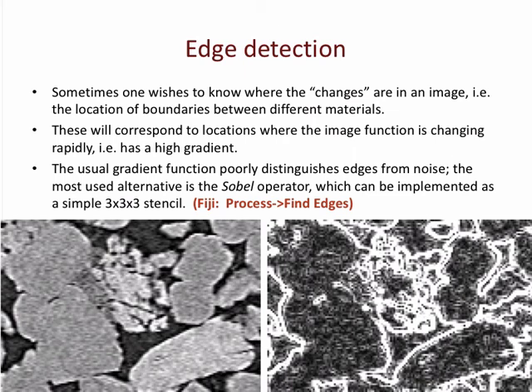So that filtered image is actually an image of means or medians. But I might want to look at the variance basically to see what the differences were in different neighborhoods. And again, I'm going to have larger variances in those cells that actually had an edge between two phases within them. So those are going to be high variance regions. Right. So that's essentially it for filtering.